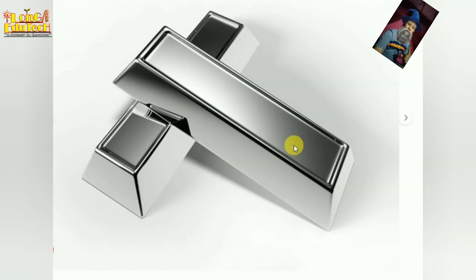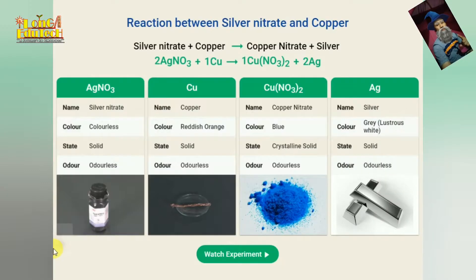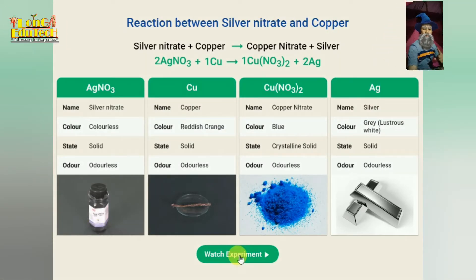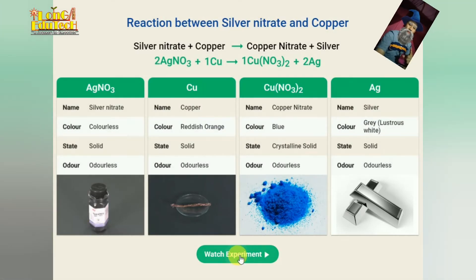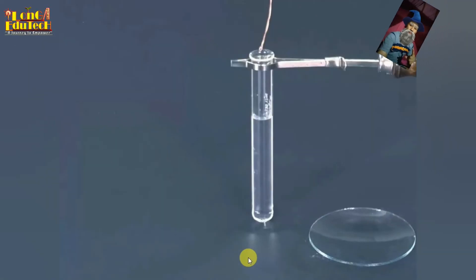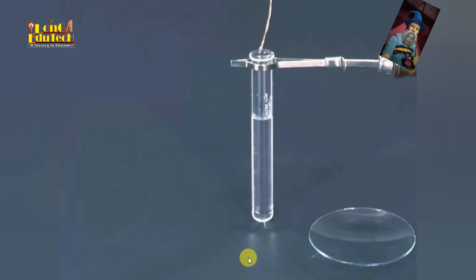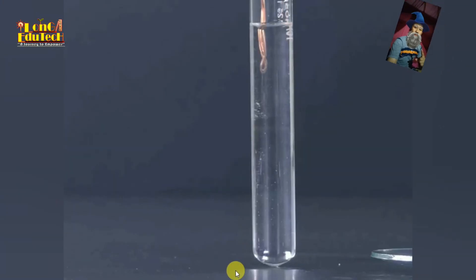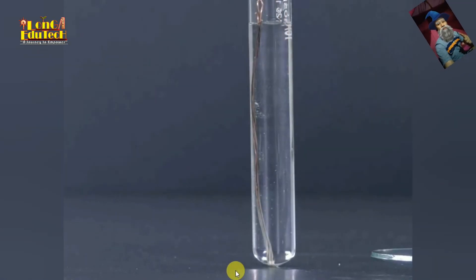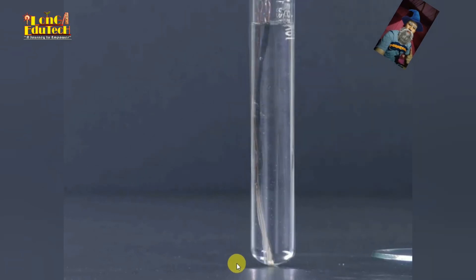Let us see the experiment now. So here we take this is the silver nitrate, this is the silver nitrate colorless, and here we put a strip of the copper.